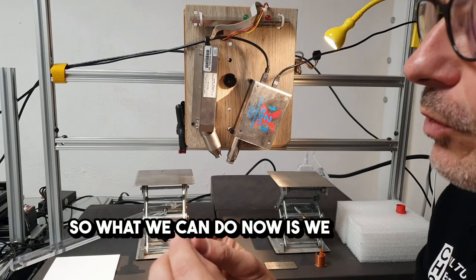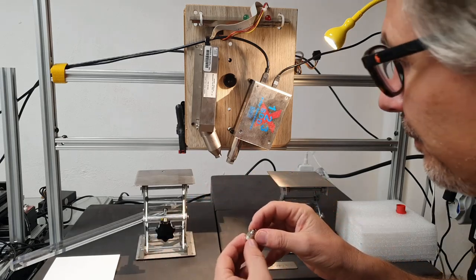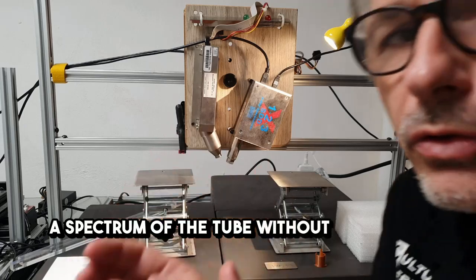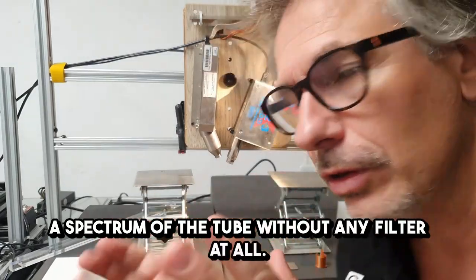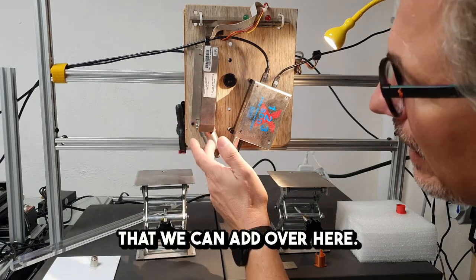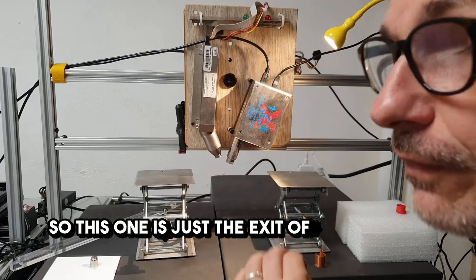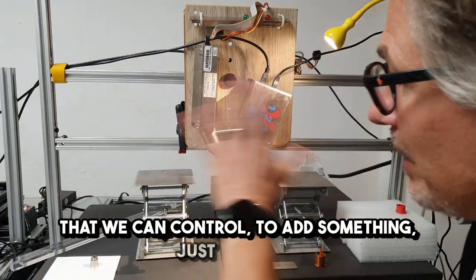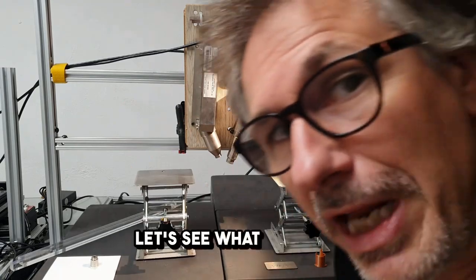now is we want to take a spectrum of the tube without any filter at all. So just the tube and anything else that we can add over here. So this one is just the exit of the tube and nothing that we can control or add something, just the tube. Let's see what happens.